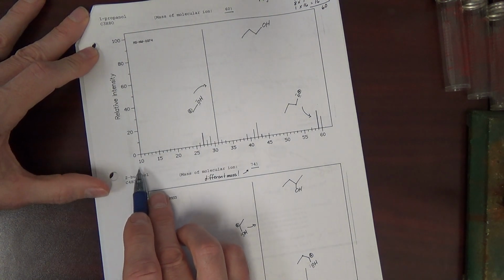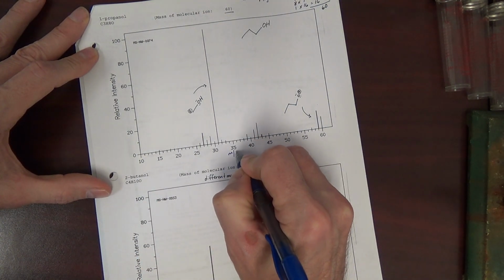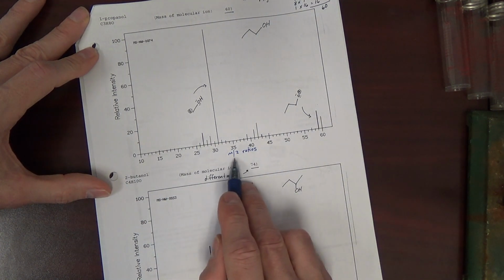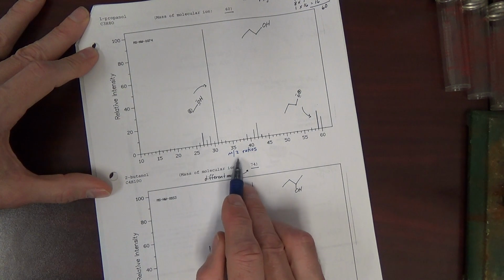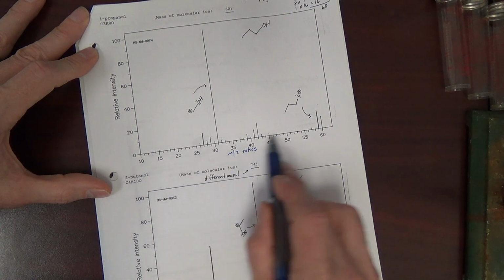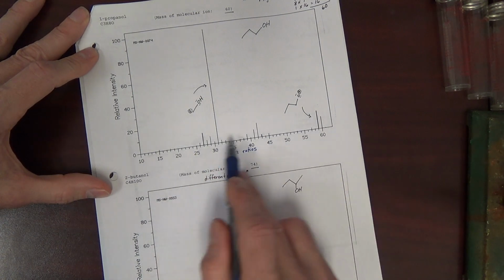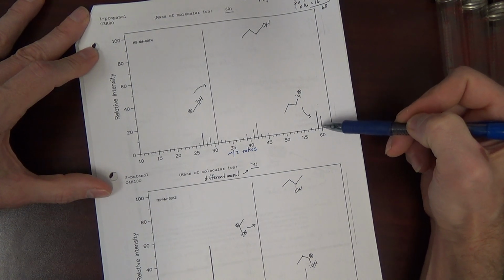Importantly, some important things. The x-axis. Usually it's written here, but this is your m/z ratio. This is essentially your molecular weights. This is mass to charge ratio. If the charge is 1, which it typically will be, thus this is typically just mass. So the x-axis, these so-called peaks or lines, I'll usually call them peaks, are going to correspond to mass. For example, right here we have something that's registering as a mass of 60.